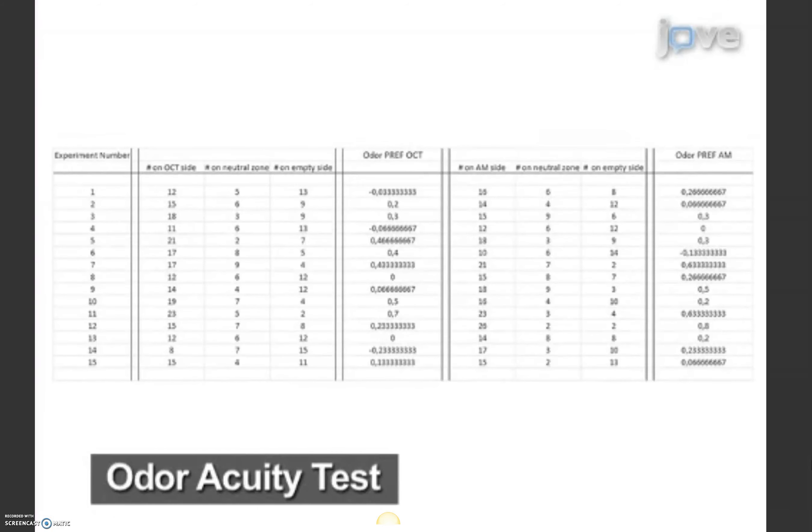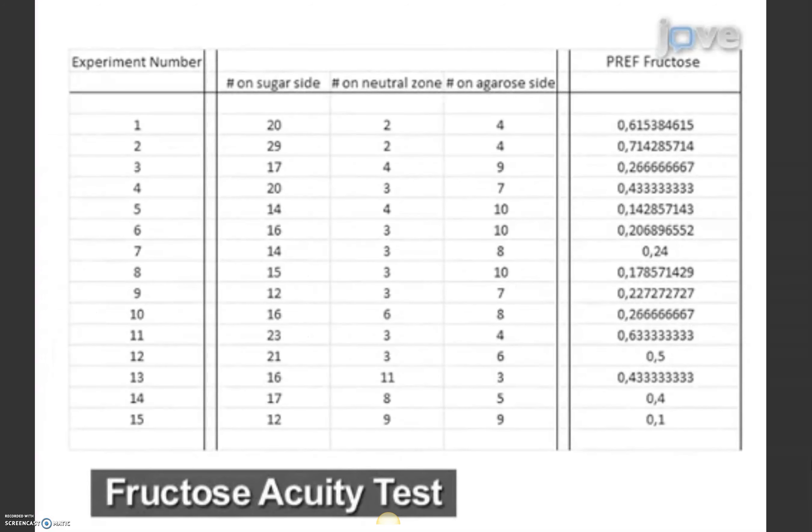Because the larvae tested were transgenic, a choice between a filled odor container and air was also offered, as well as a choice between pure agarose and agarose plus sugar.